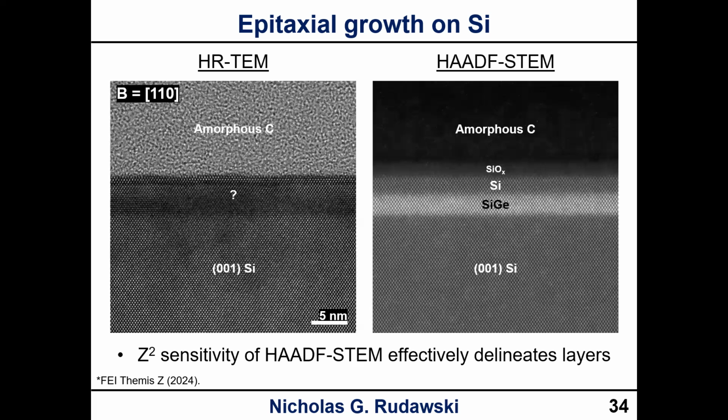Thank you, Nick. Sorry, apologies, this is from Lakshay Shahan. How accurate is two-beam imaging in STEM mode in comparison to traditional two-beam TEM imaging of defects?